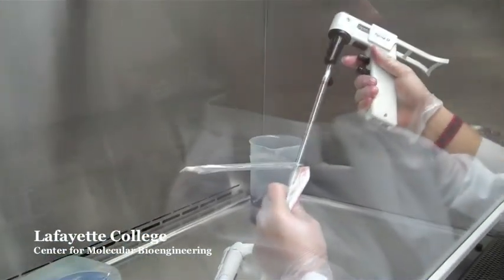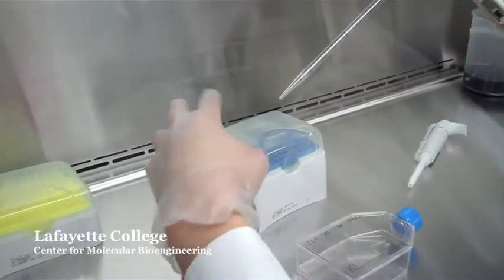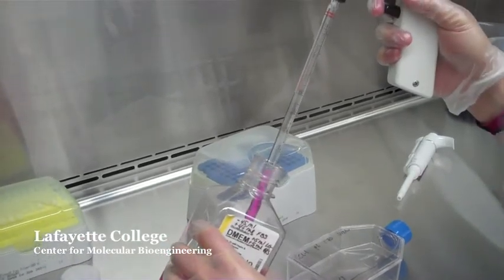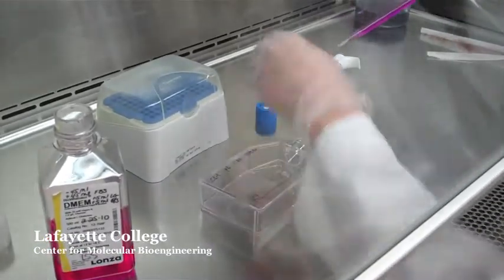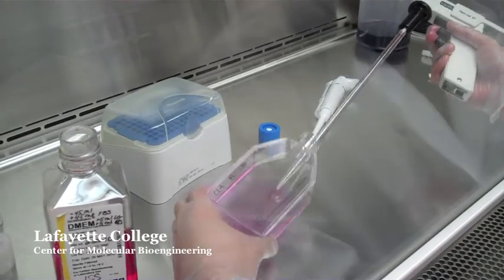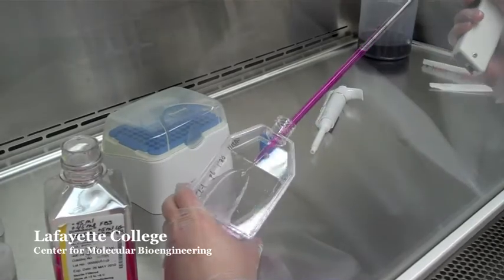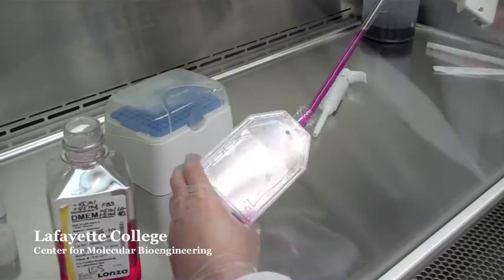Add 10 milliliters of media to the flask, spraying the inside surface of the flask to disperse the cells. Pipette the media up and down and continue to spray the surface of the flask a few times to ensure that all cells have been dispersed. The media should turn cloudy — this is normal.